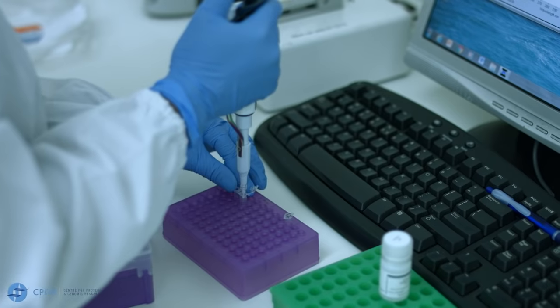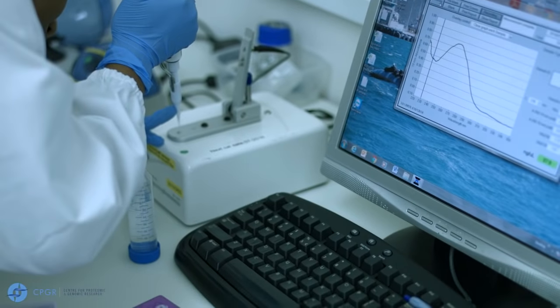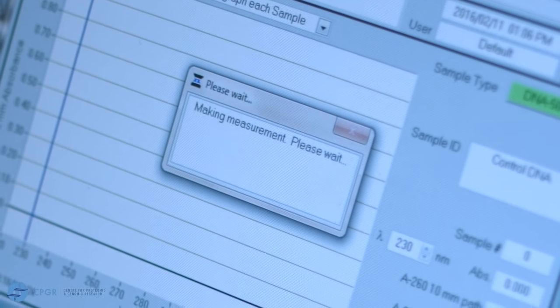Samples are always spun down to ensure that the DNA is at the bottom of the tube. A control DNA sample is always included of known concentration. This is used to check that the instrument is working optimally.